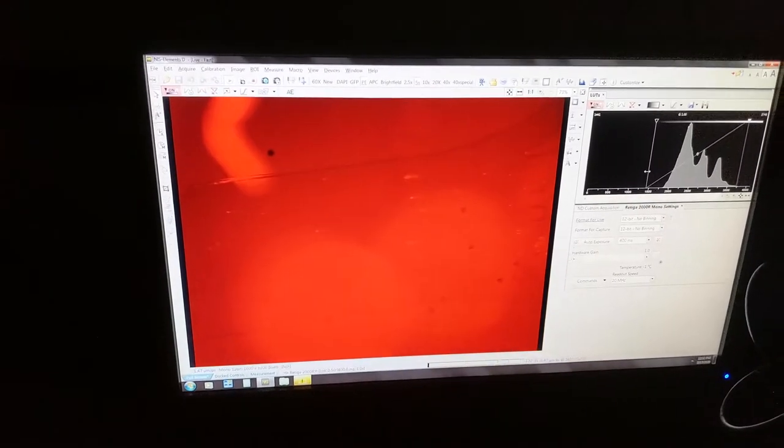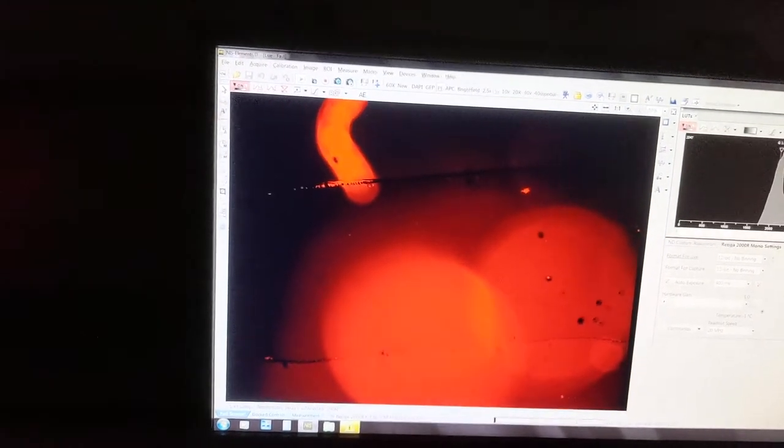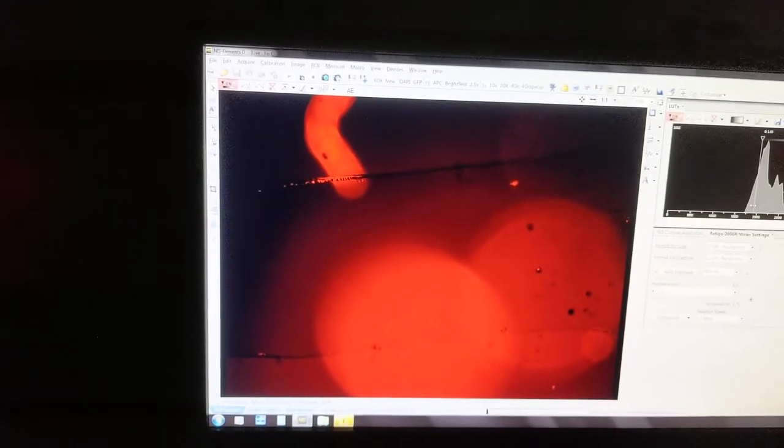And we're going to move it so you can see more of the channel. Beautiful. The red are the cells, so we can hit run. Oh, it's hard to see in the dark. Okay. So now the pump is flowing. Kaylee's going to mess with the brightness settings. Ooh, look at those circles on there. Nice.